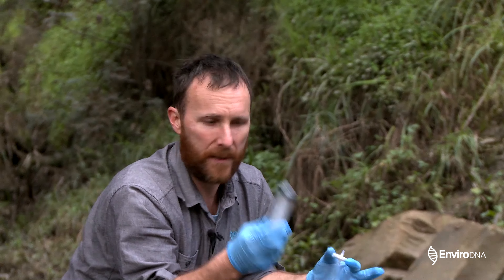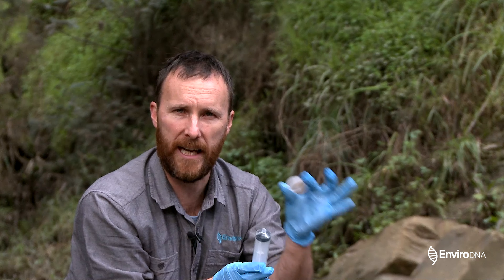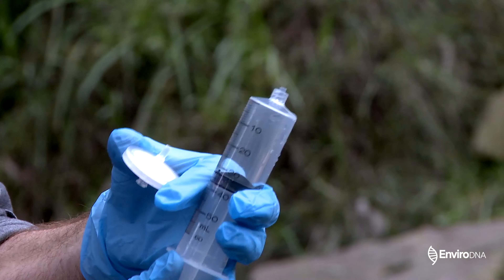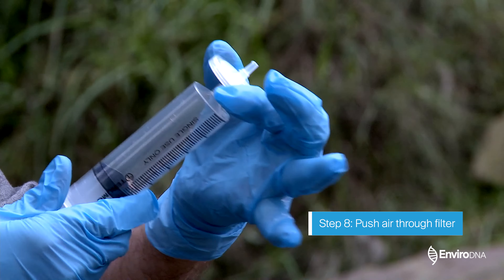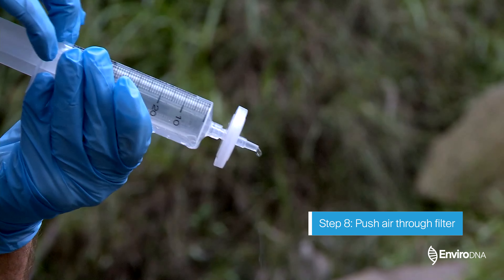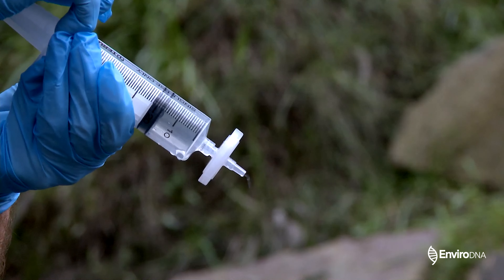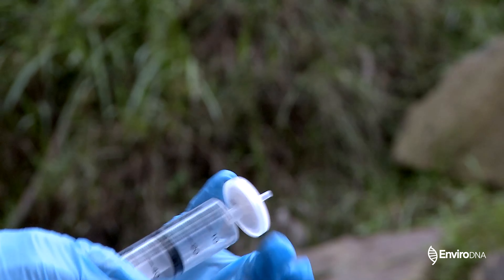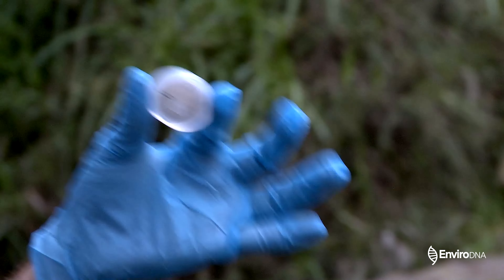That's about as far as I can get here — I've done almost three syringes full, so that was about 140 mils. The last thing we want to do is get rid of any excess water in the filter, so I'm going to fill up the syringe with air, screw it back on one final time, and just squeeze out those last few little droplets of water. We've now taken our first sample. I'm going to take our second sample and repeat that process, then we'll finish up the filters at the end.